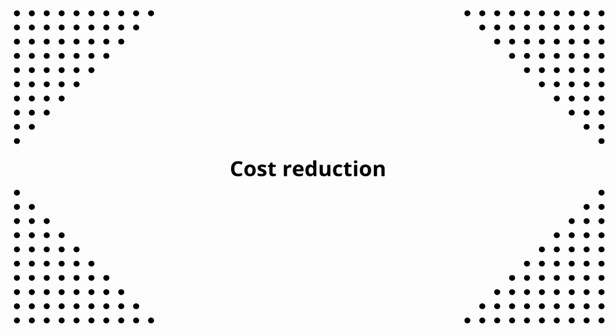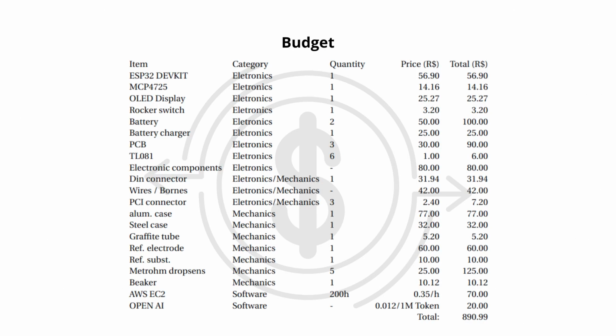Cost reduction. In this spreadsheet, we demonstrate the significant cost savings we achieved compared to commercial models, making the project accessible to educational institutions and students.